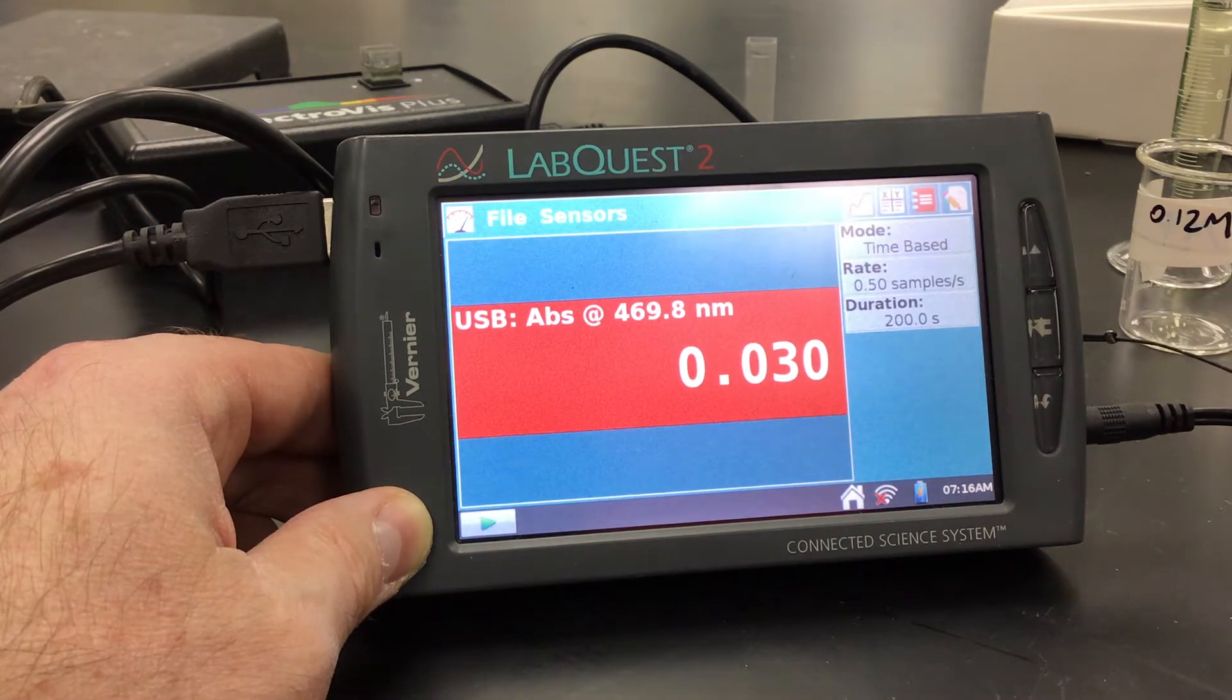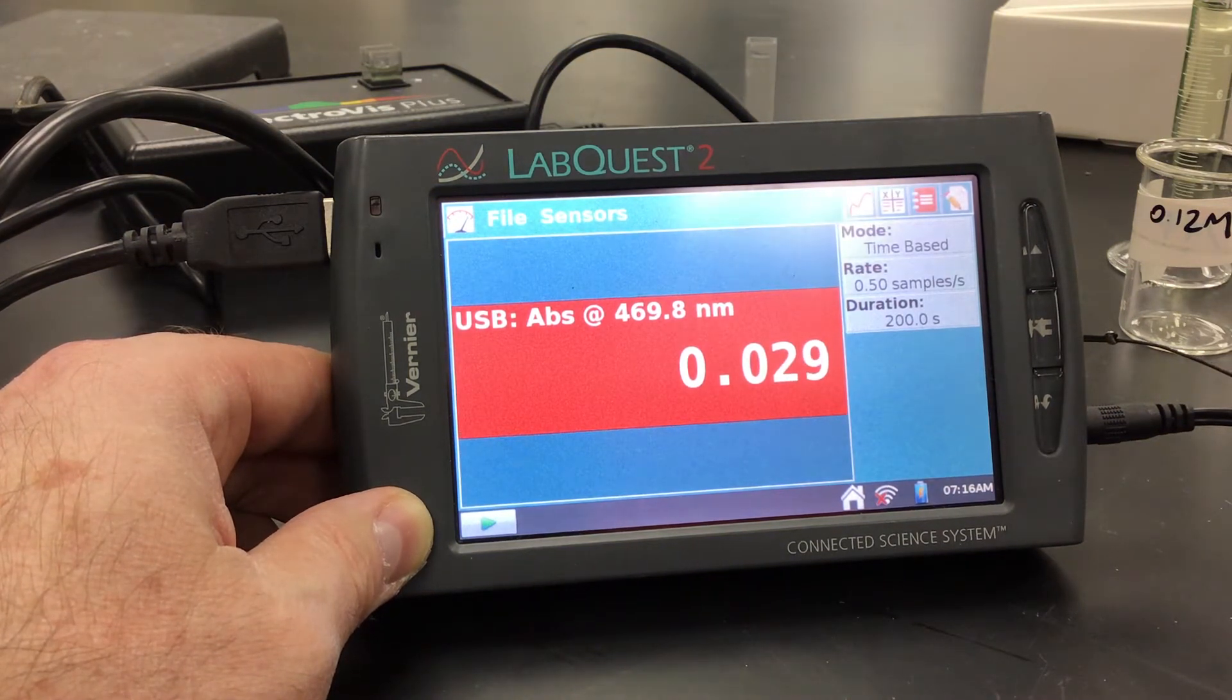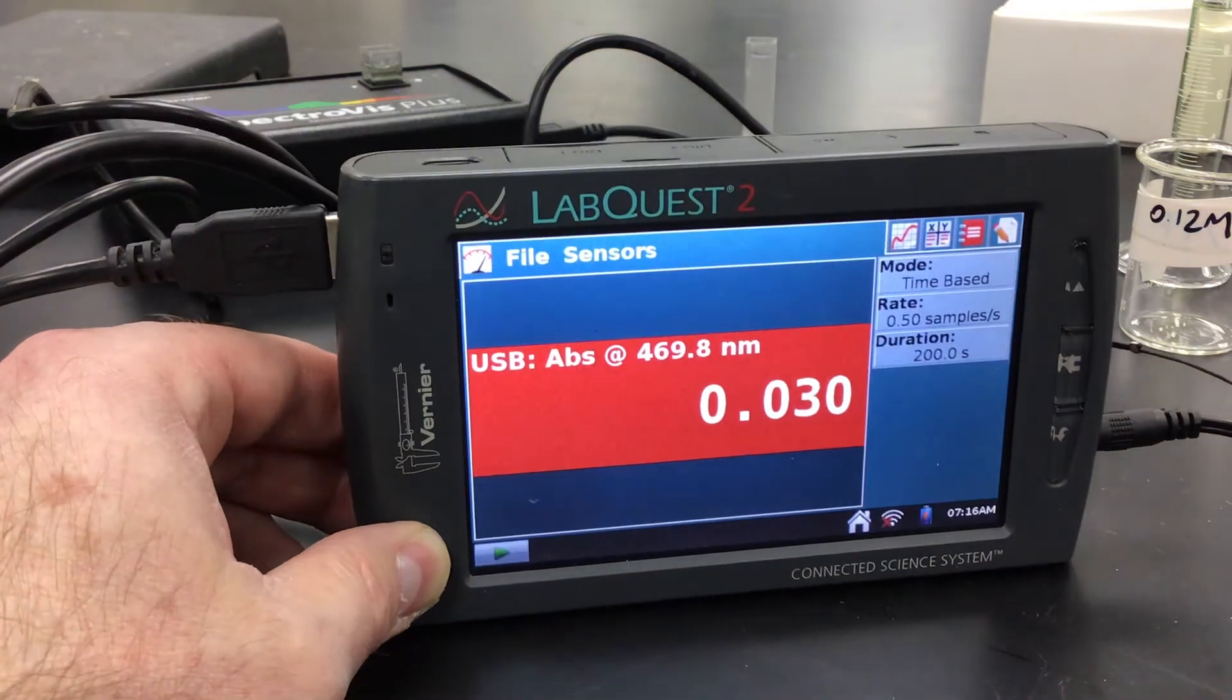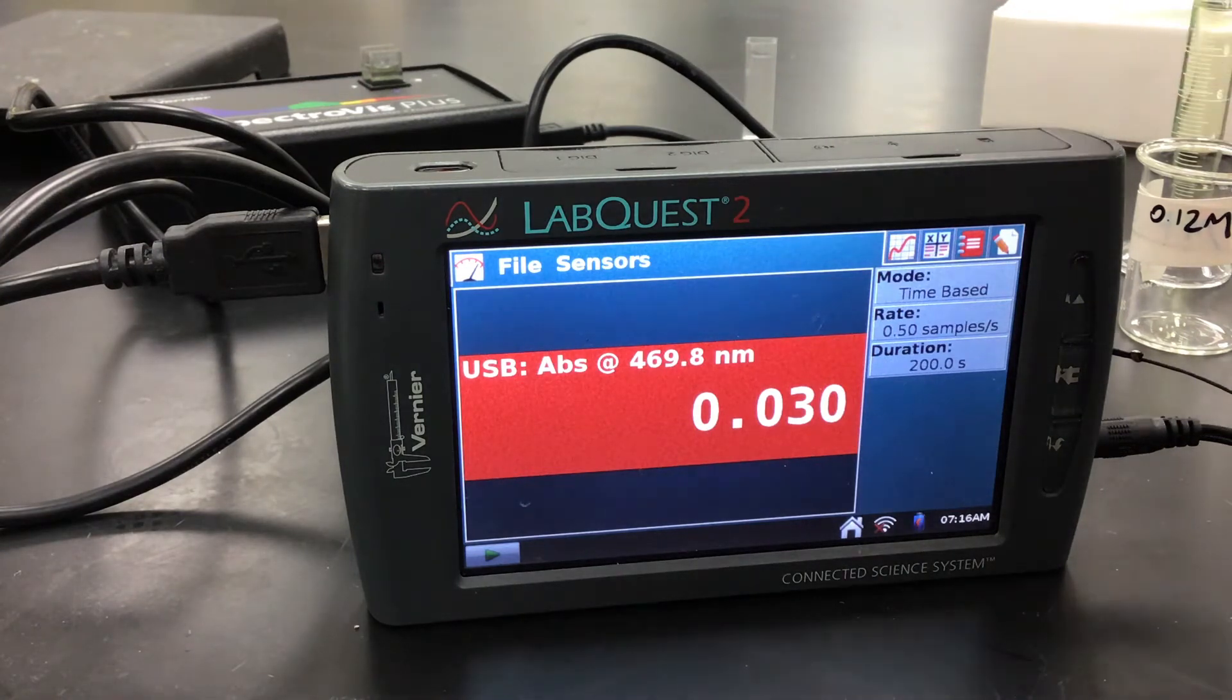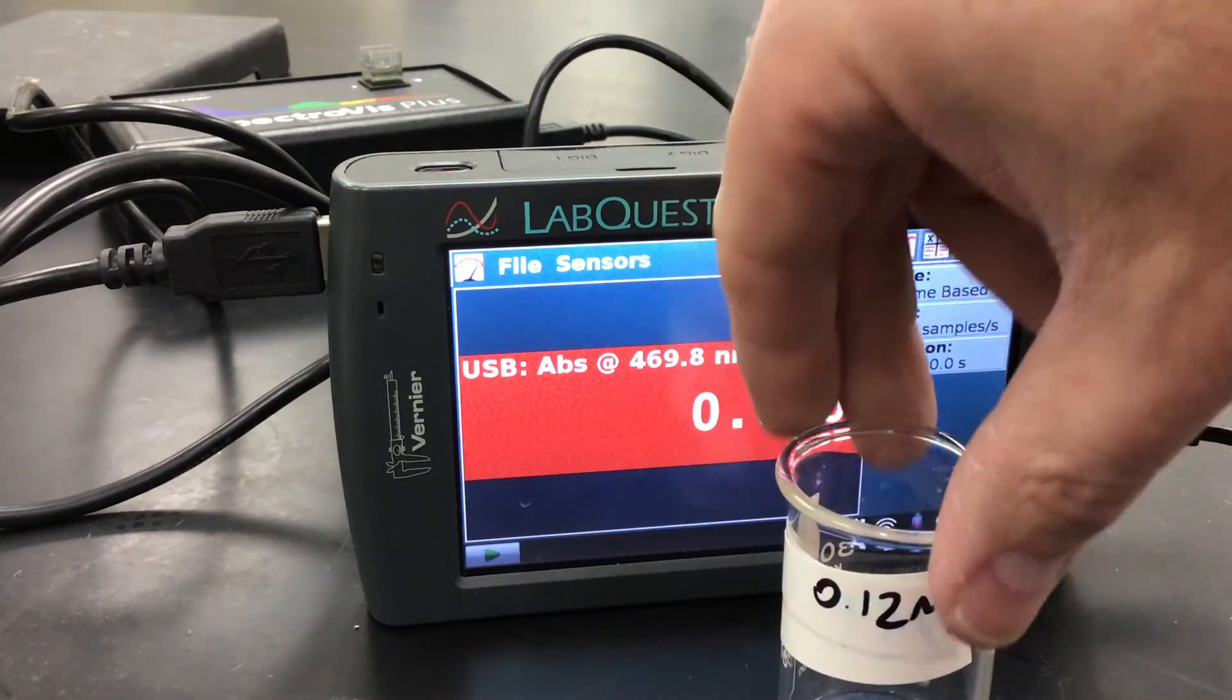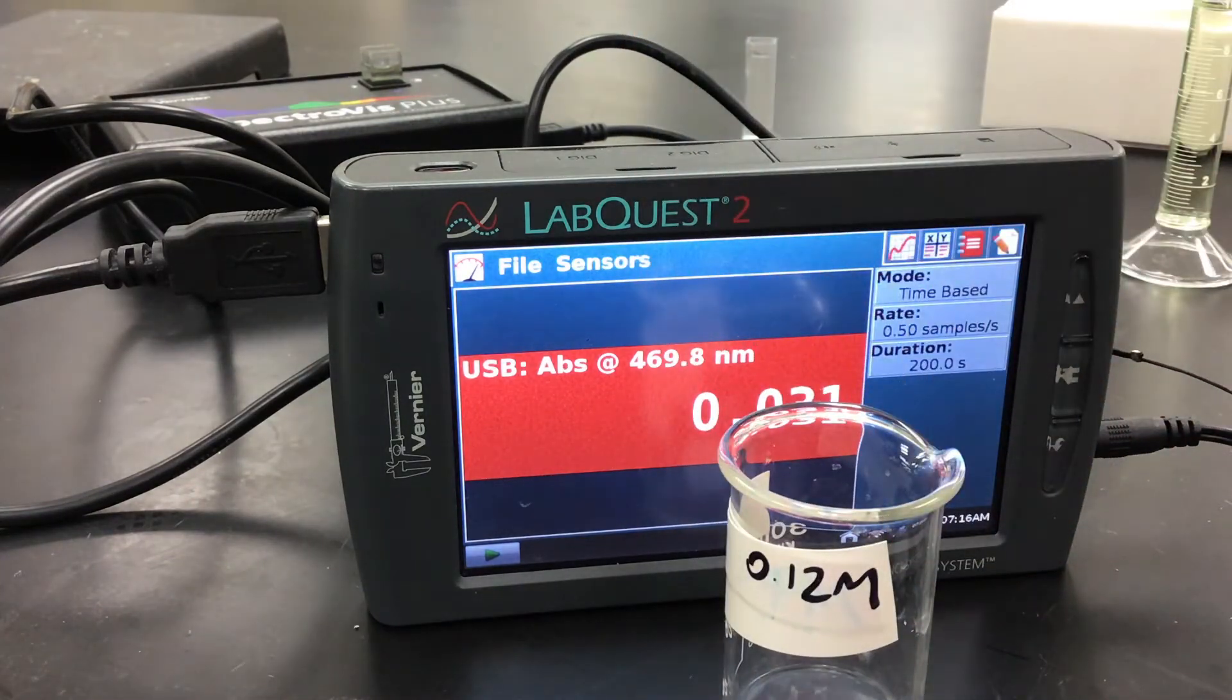All right, so now what we're going to do, we're in time-based mode. What we want to do is that we want to be able to mix our solutions in the quantities that they say. And what I'm going to do is I'm going to mix them in this beaker. And once I mix them, I'm going to make sure I've got a cuvette ready. I'm going to mix them together, pour the solution into the cuvette, and then I'm going to start collecting my data.